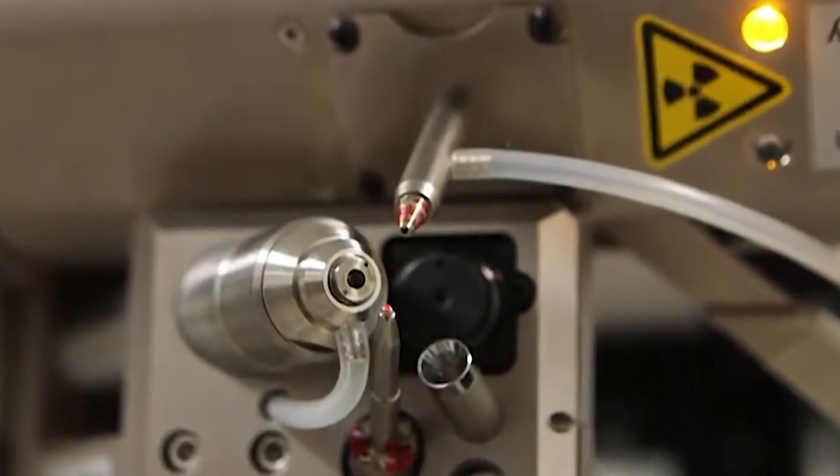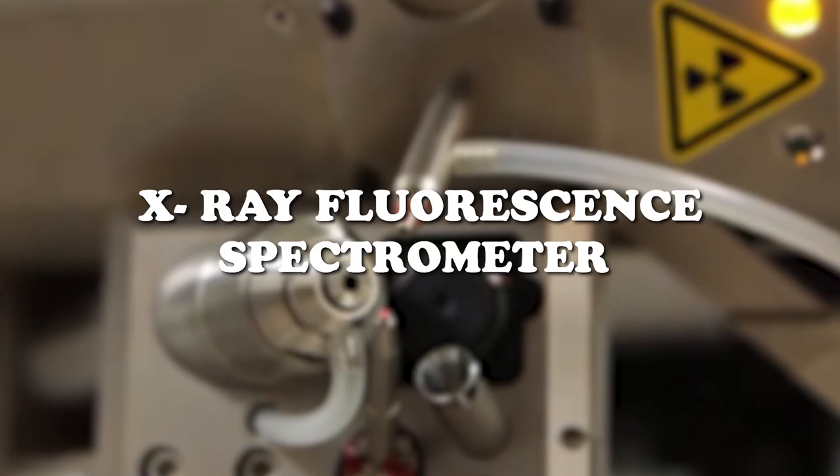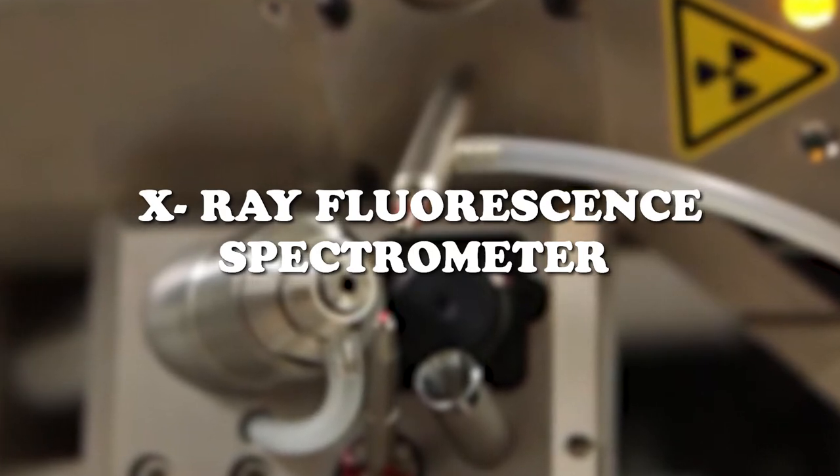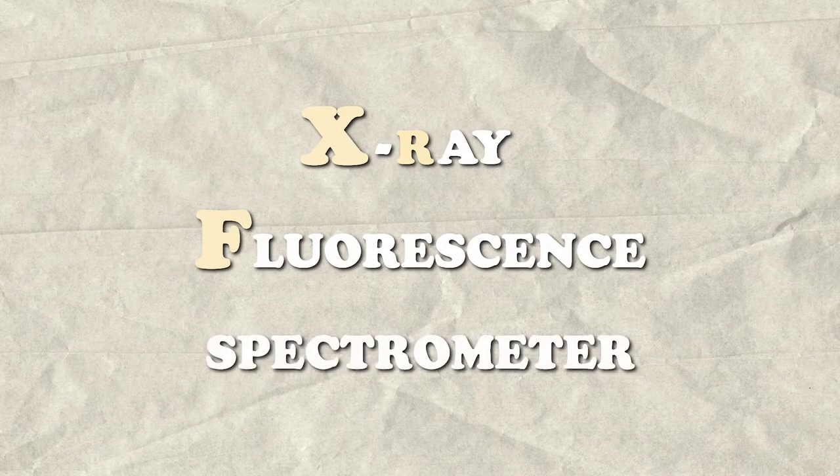The workhorse instrument is known as an X-ray fluorescence spectrometer. We typically refer to it as XRF — X-ray fluorescence spectrometer.